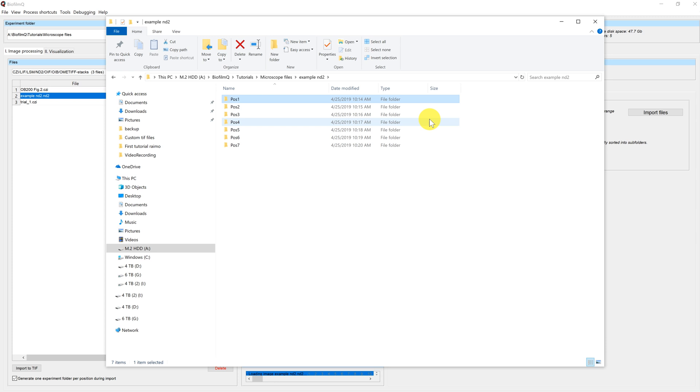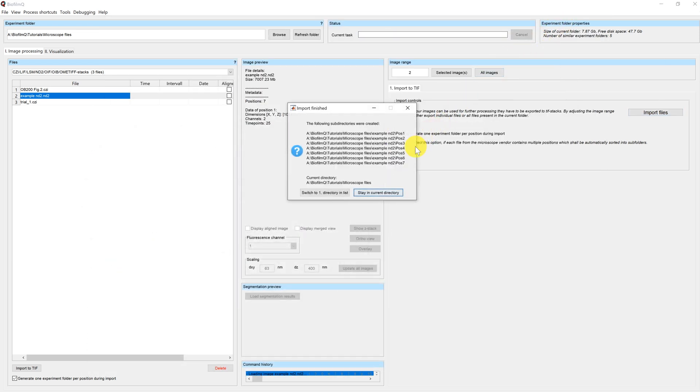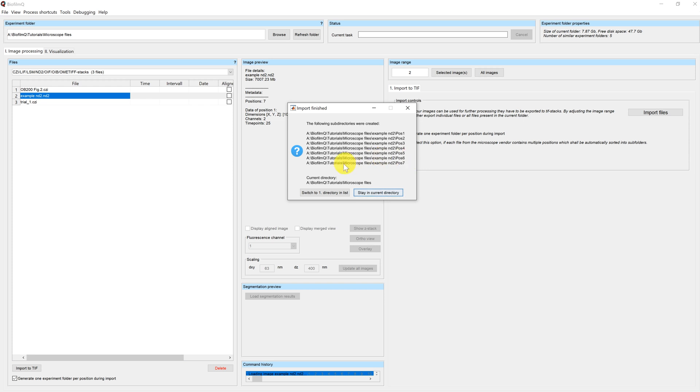Now that all seven position folders have been generated, the import is nearly done and we go back to the GUI. Once the import is completed, this dialog pops up, where you can see the different directories which were created, in this case one folder per position, and you're being asked if you'd rather switch to the first directory in the list in order to continue processing or stay in the current directory.